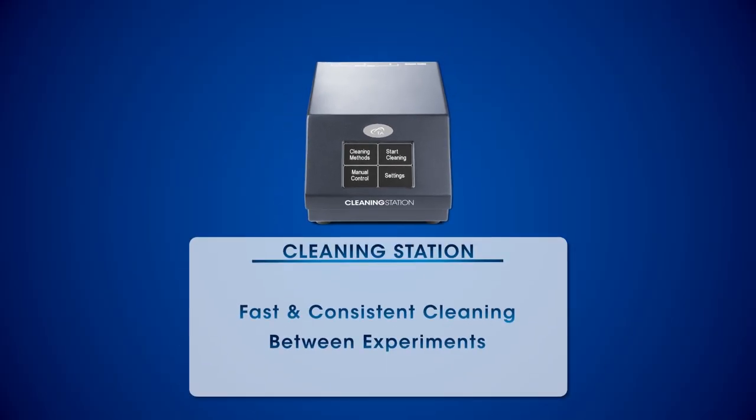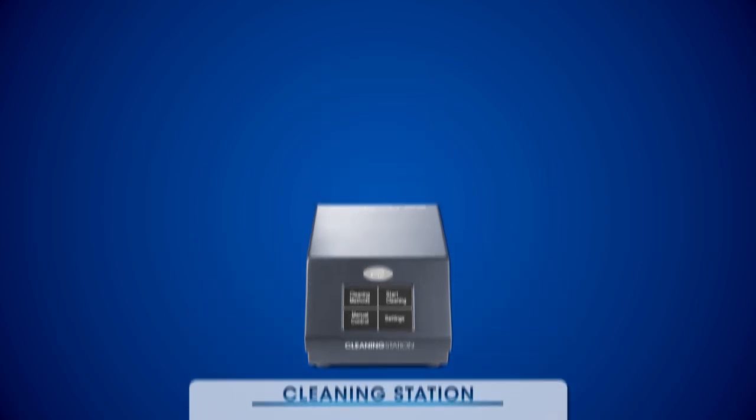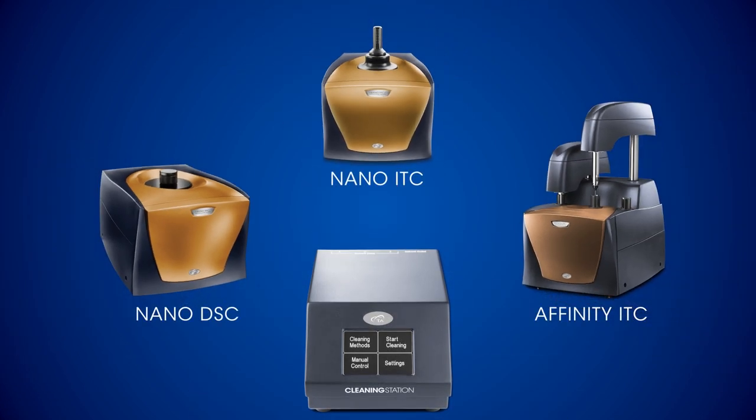Hello and welcome to another TA Tech Tip. In this Tech Tip, we'll be demonstrating the utility of the cleaning station from TA Instruments. The TA cleaning station is a device that enables fast and consistent cleaning between sample experiments and can be used with the NanoDSC, Nano ITC, and Affinity ITC.